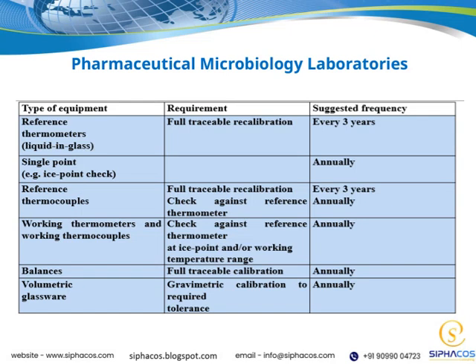Let's take a moment to focus on pharmaceutical microbiology laboratories. These labs are a crucial part of the overall quality assurance process in pharmaceutical manufacturing. They are responsible for testing and monitoring microbial contamination, ensuring that products are safe and effective for patient use. In these laboratories, we conduct a variety of microbiological tests, from detecting bacteria and fungi to assessing endotoxin levels.